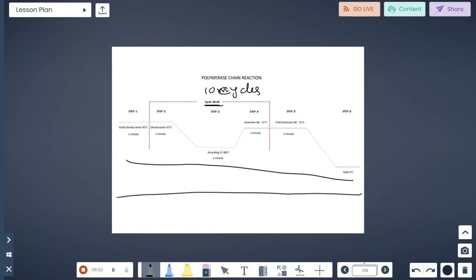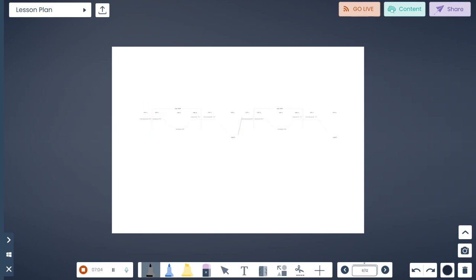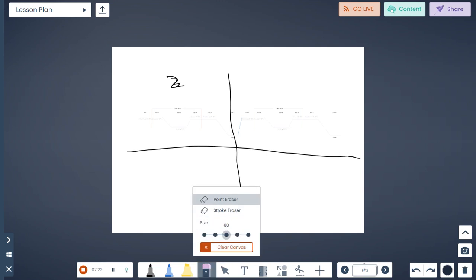In the second set of reaction you will use these 30 to 40 cycles, so that the specific products will be formed in high amount. So this is how you will set up a nested PCR reaction in the PCR machine. This is the first reaction that you are setting up.